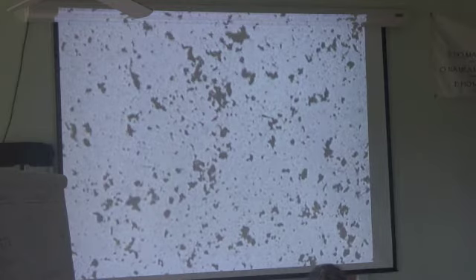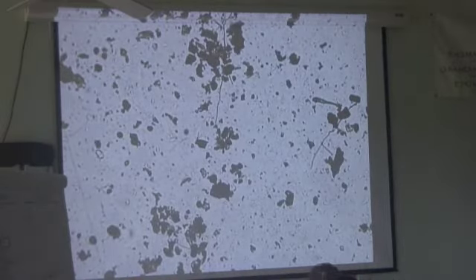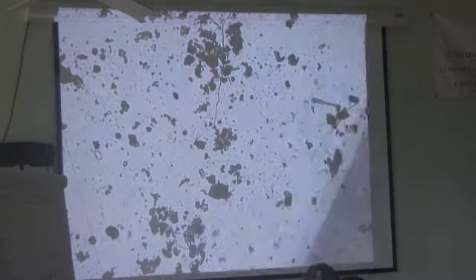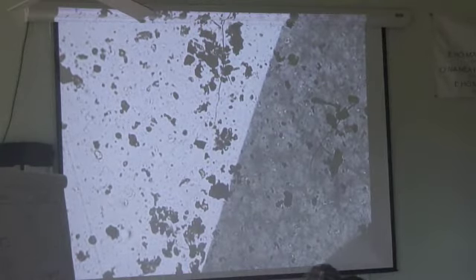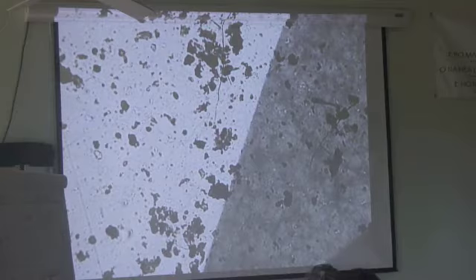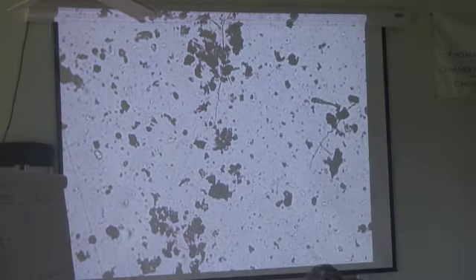There we are. Go check your Mac, make sure that you're in focus. Now we're going to go up, and there we are. This is a new sample, but it's still the same thing. Now I'm going to just check my condenser and make sure that that hasn't gotten out of whack, that I haven't hit something. So there we are, we're in focus. And now we're up to our 40X. Bingo, wasn't that fast? Doesn't take much time.